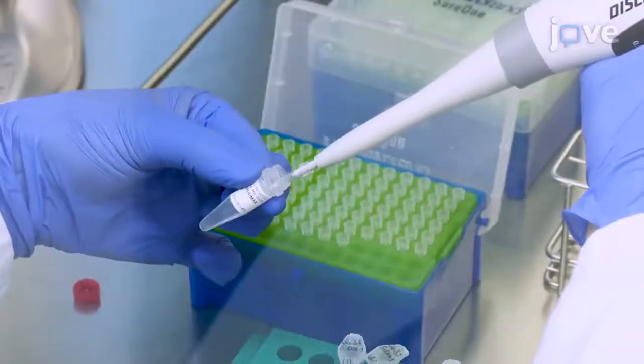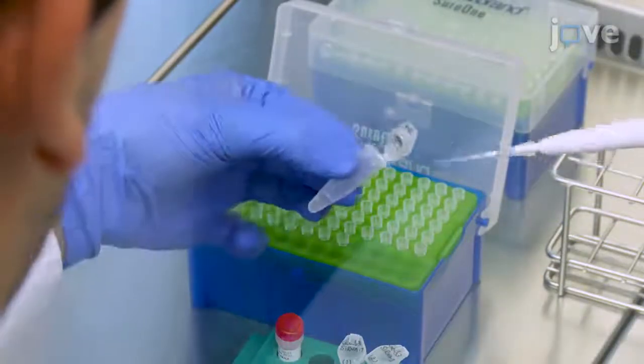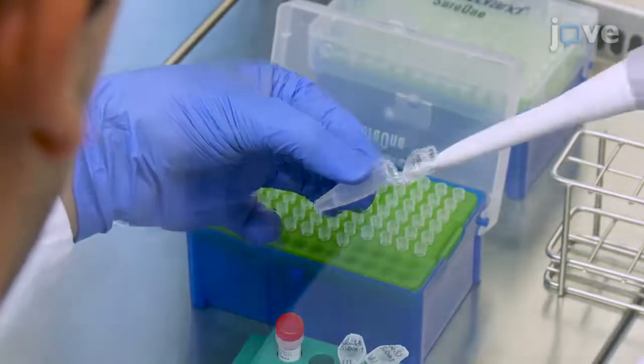The next morning, add 9 µL of each lipid-based transfection reagent of interest to individual microcentrifuge tubes containing 150 µL of reduced serum medium per tube.